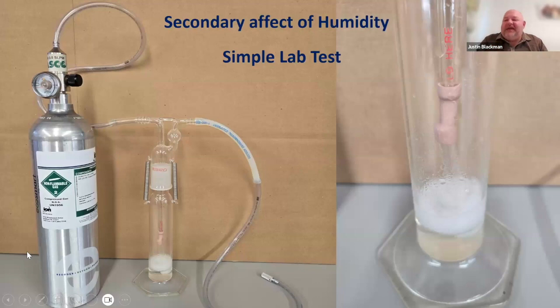So it's very easy actually to do our own tests. Many of us will have cylinders of calibration gas available. Many of us will be used to doing a bump test. Now, the picture is showing a bubbler. Some lab folks will be used to this. We have water in the bottom of the bubbler. On the right-hand side is a blown-up version. There is a small air stone or frit, they're sometimes called. We push isobutylene gas, 100 ppm, through the water.